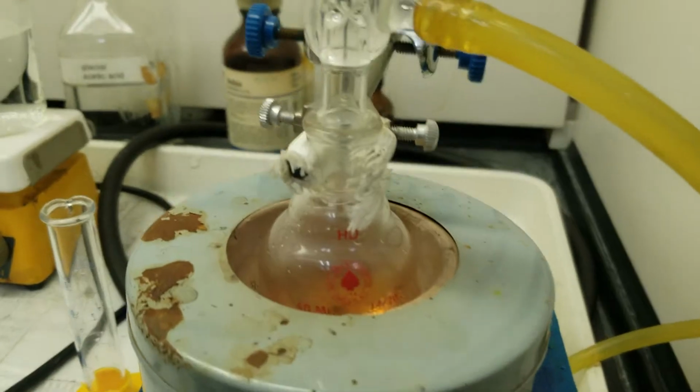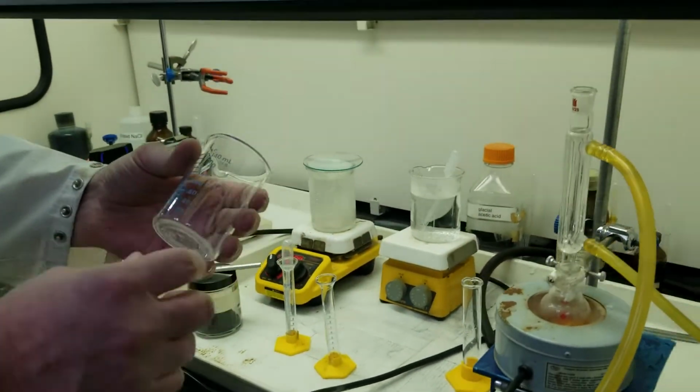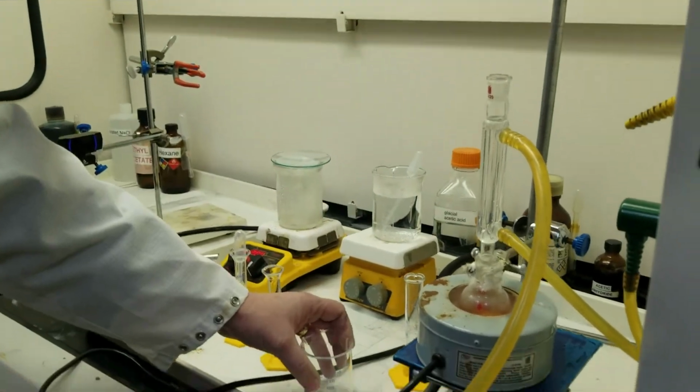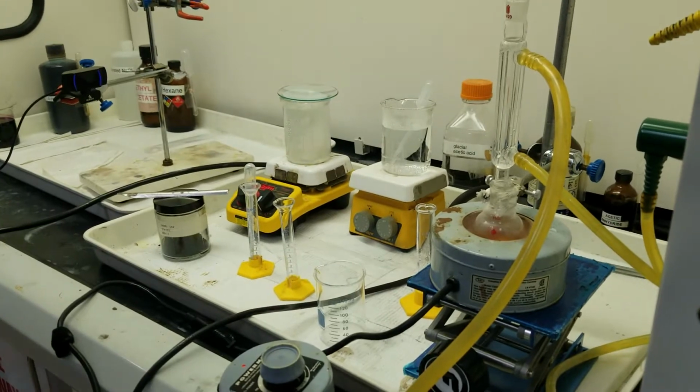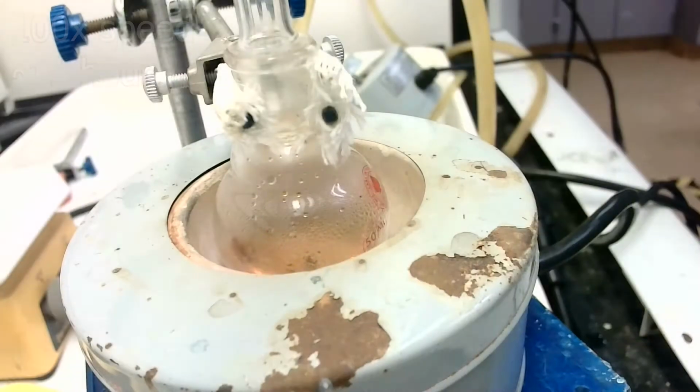We're starting our boiling. We have our activated charcoal ready. The only other thing we'll need is about 50 milliliters of ice water in here for the end of the reaction, which we'll do during the 1 hour of waiting. And cut. All right.